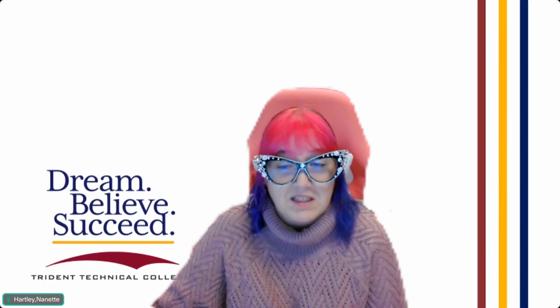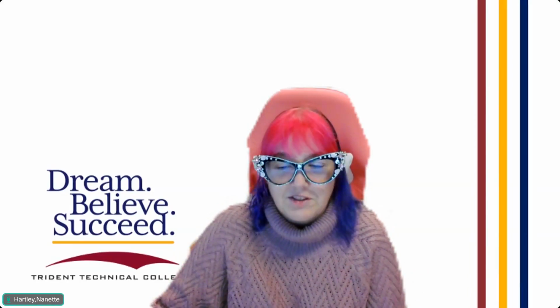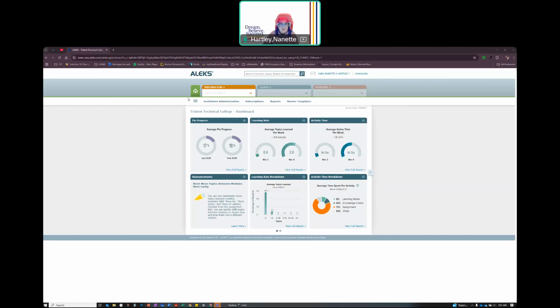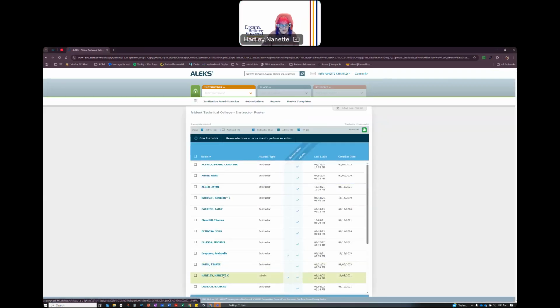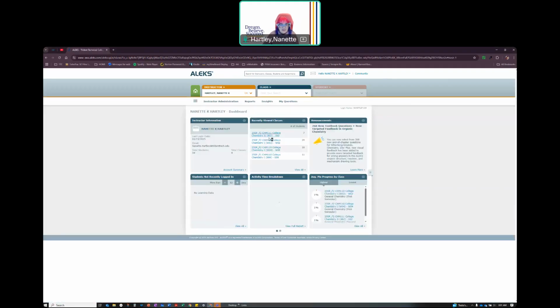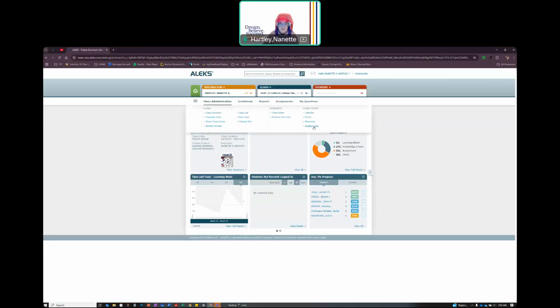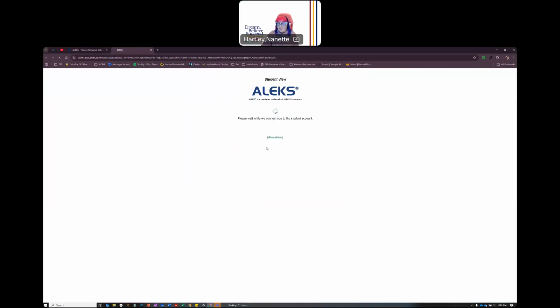So we're going to set up for experiment 2, which is the buffers experiment. I'm going to go ahead and set up my screen so that we can do that. Screen 2, I will share this. Get this out of the way, and then I will come into myself as the instructor, get into our one-on-one class, and then set up my student view. And that way we're all looking at the same thing.